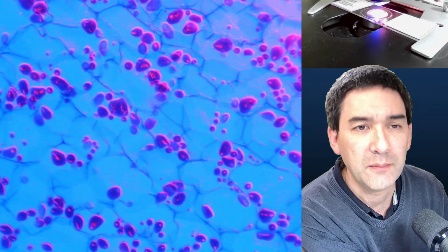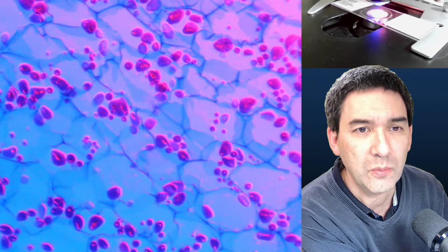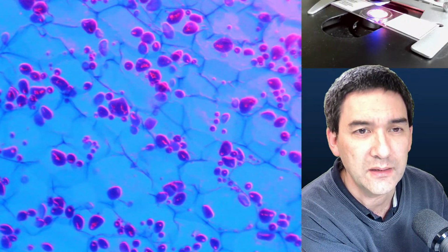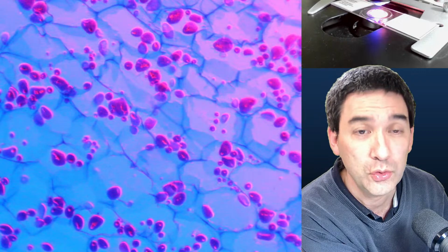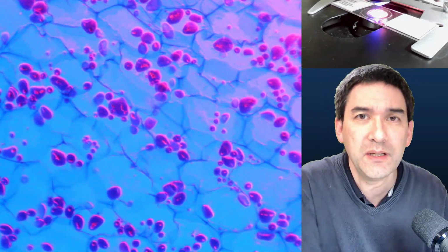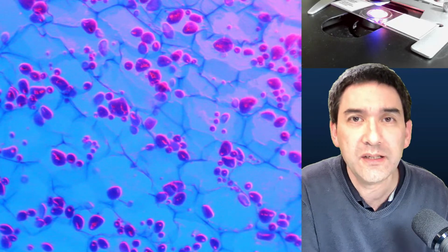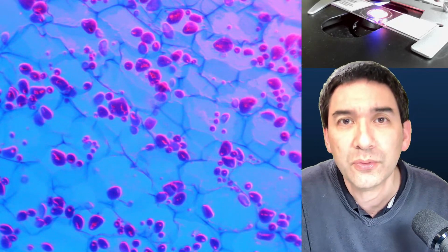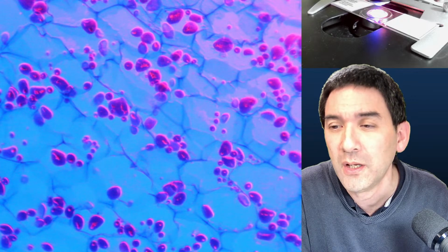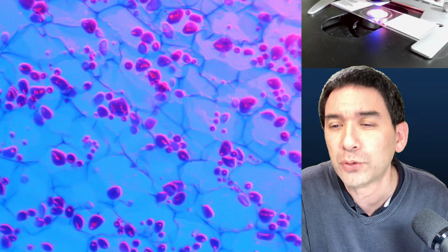That is essentially one of the nice things about Rheinberg: especially if you want to make YouTube videos, you can add some color to the specimens without actually having to stain them. And in some cases, it does improve the contrast and makes things visible that otherwise you would not be able to see. Could the heat of the halogen lamps be a problem for these filters?